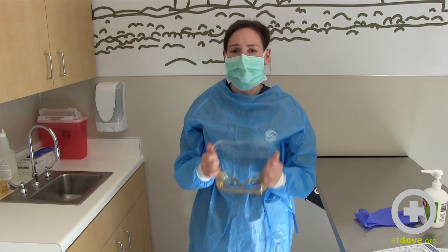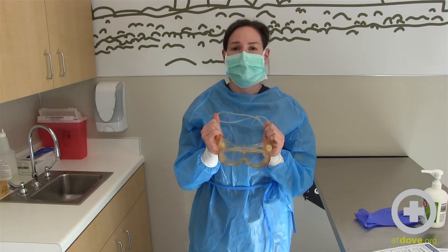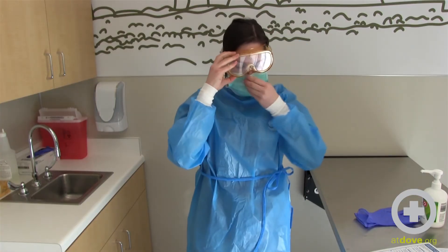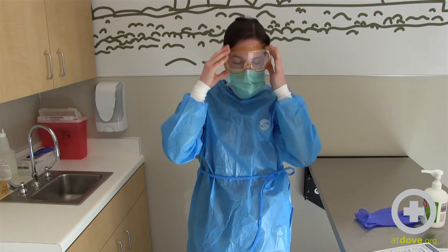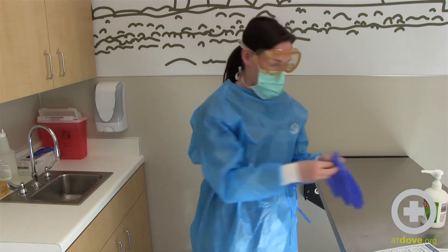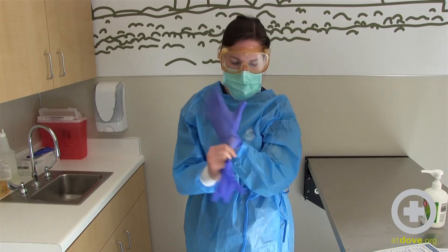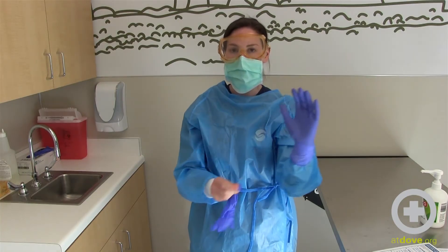The next part is either to wear a face mask or goggles, so I have my goggles here. And now to put on your gloves — you want to put your gloves on so they're covering the wrist of your gown.